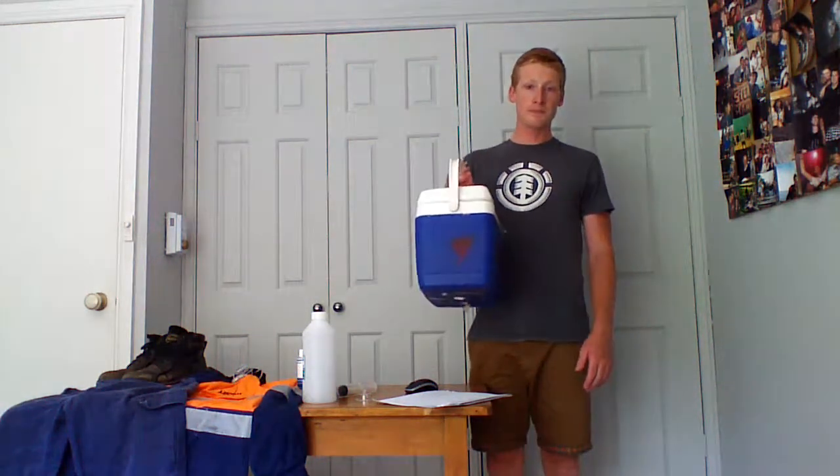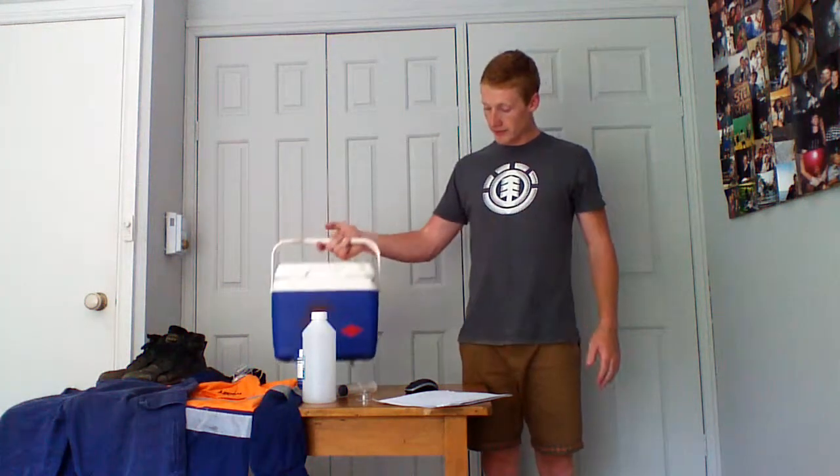The sampler must complete the chain of custody, and this original document must stay with the samples. A copy of this documentation with custody details should be sought from the laboratory to confirm receipt and appropriate transfer of the product. So a list of all samples that I've taken on that day is written onto the chain of custody. It's in the SCIT with the samples. It's packed with ice. I take this to the laboratory. I've signed it. I give the samples to the laboratory. They give me a copy of the chain of custody, and I need to keep that and add it to our reports.